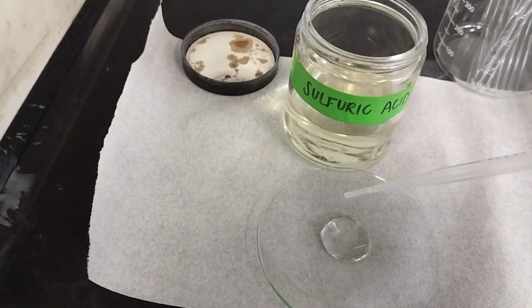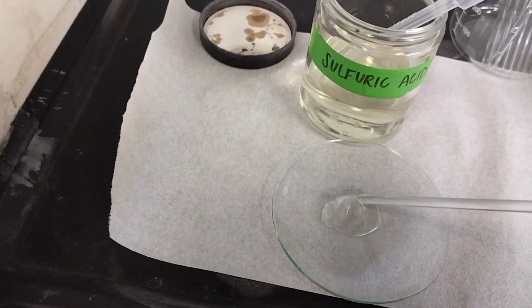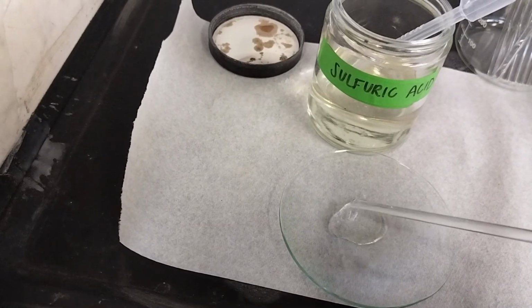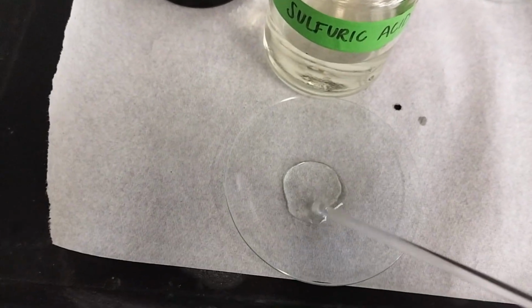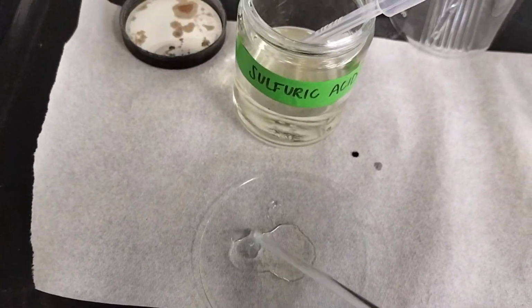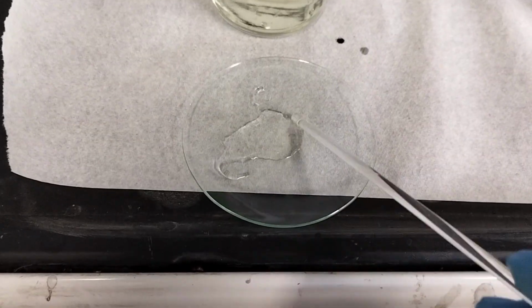Now I will stir the cotton fiber in the sulfuric acid and wait for a few minutes to see the results, and I'll come back here later. Wow! After about 3 minutes, the fiber has completely dissolved in the sulfuric acid. So this confirms that the sample is cellulosic, or this is cotton fiber.